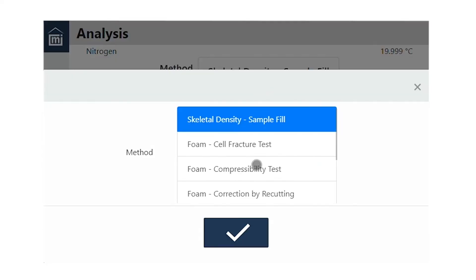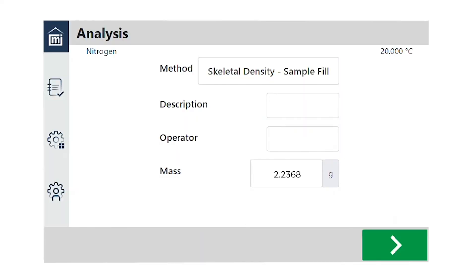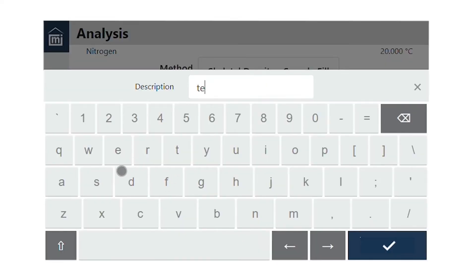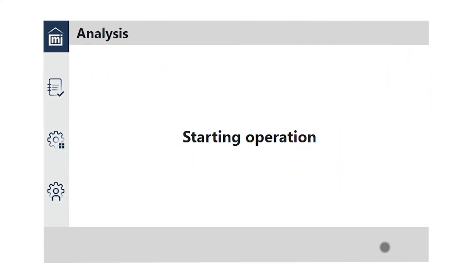Just select your method, and enter the sample description and the operator's initials, and hit start.